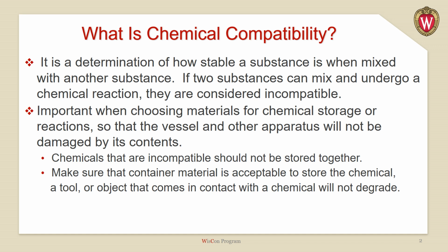Make sure that the container material is acceptable to store the chemical, and that a tool or object that comes in contact with a chemical will not degrade.